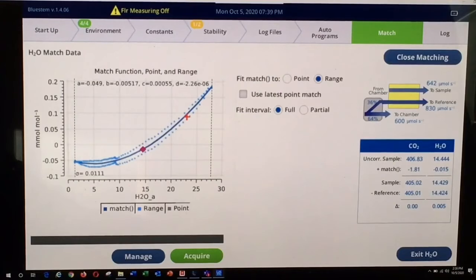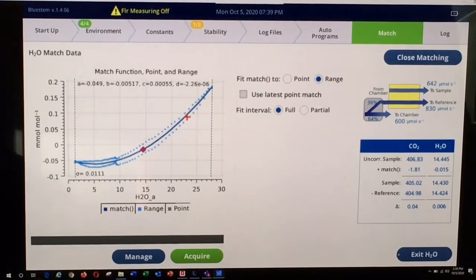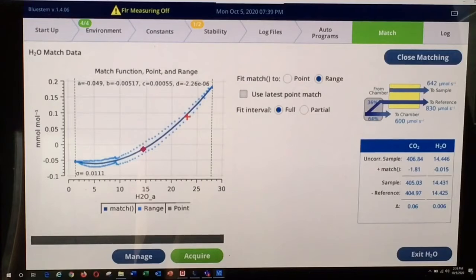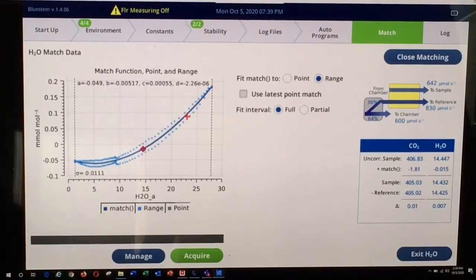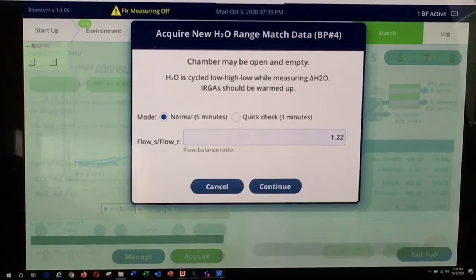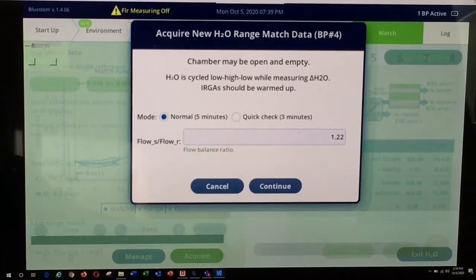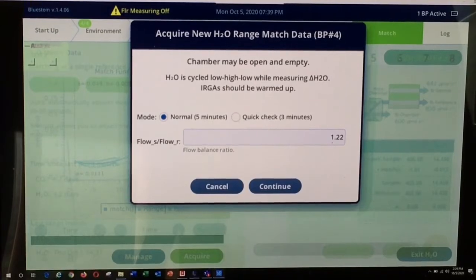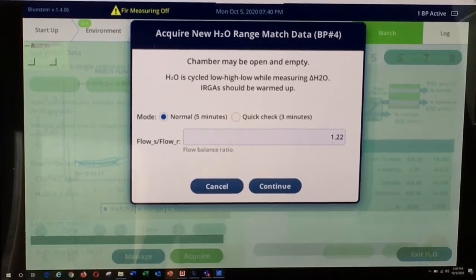As you can see, this instrument already has a range match curve implemented for water vapor. If you need to run a water range match — for instance, if directed to by the system or warm-up tests — the process is very similar to running a CO2 range match. You simply select the Acquire button, then select a flow split ratio and choose either a normal curve or a quick check. For water vapor, I tend to run normal curves. You can start by using the same flow split ratio used for the CO2 range match. However, be aware that you may need to alter this ratio somewhat, as water is more adsorptive and typically requires a slightly different flow split than a CO2 range match.